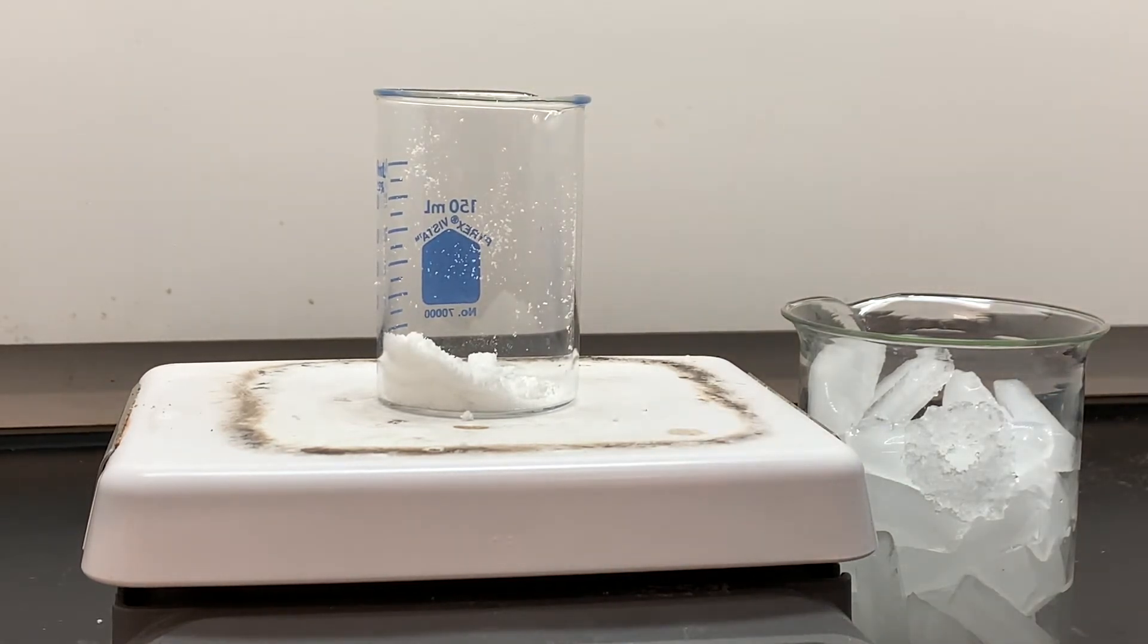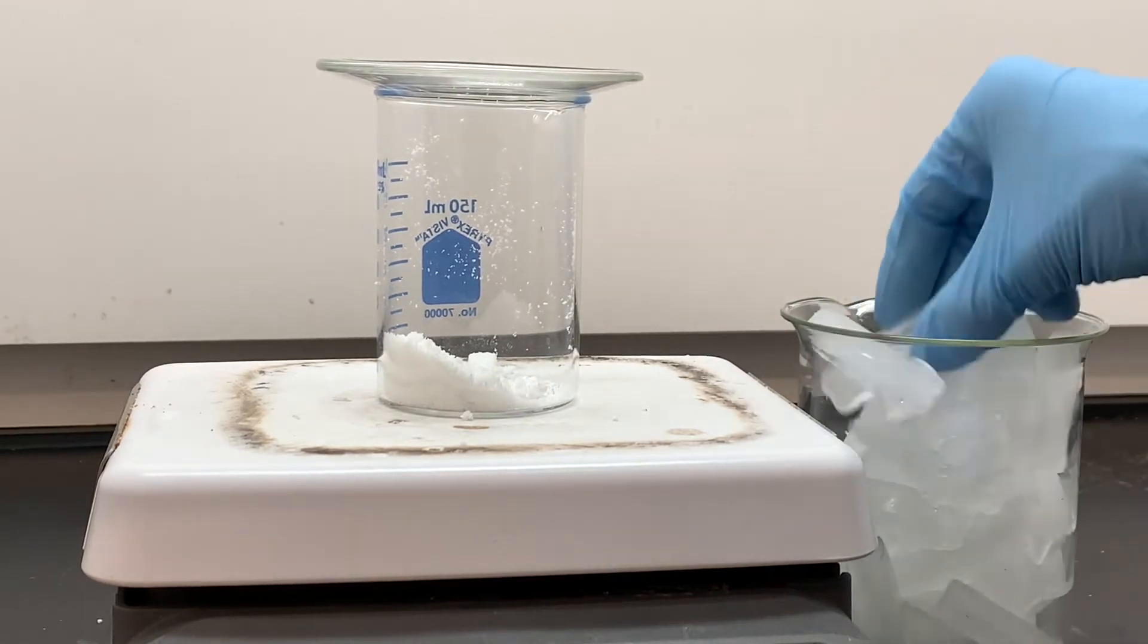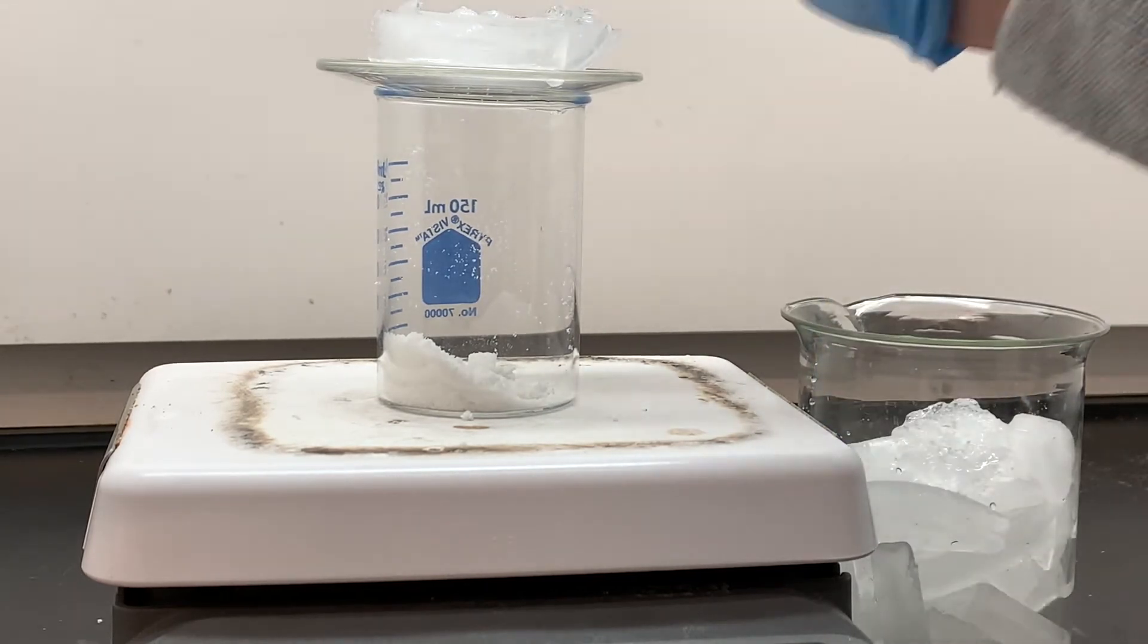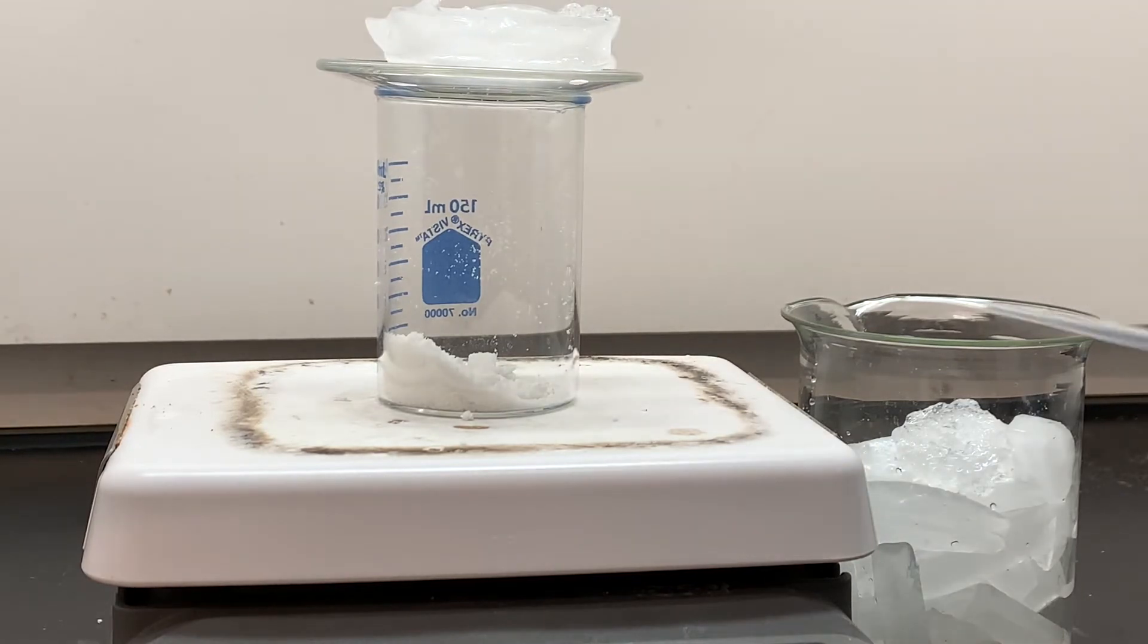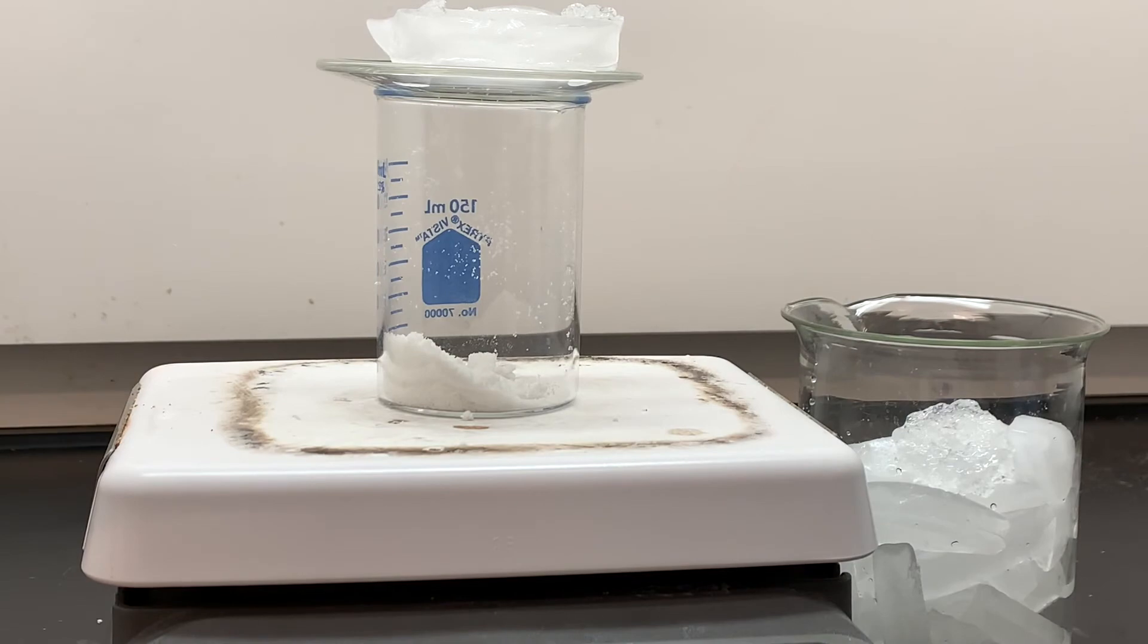As it heats up to a gas, we are going to catch it on the underside of this watch glass, which I'm going to be chilling with some ice cubes. What you want to be looking at is the underneath of this watch glass. This is where the crystals are going to start forming. It's going to take a while for the temperature to get warm enough for the crystals to actually start to form.